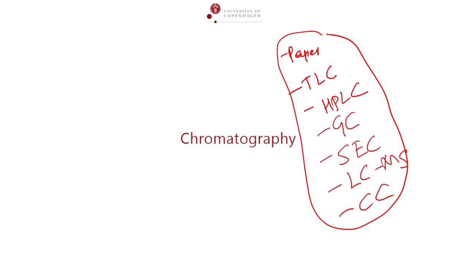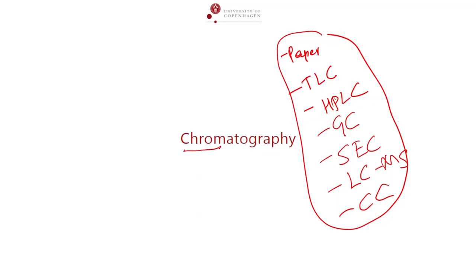Now, let's discuss what we mean by chromatography and how the word came about. Can somebody define what is chromatography? Separation based on color. That's a beautiful definition, because chroma means color, and graphy means graphs or writing. It's basically color writing. Now I'm asking this question: is everything colored in the world? Are proteins colored? Are amino acids colored? No, right? It's the original definition, because back in the days, they tried to separate things based on color.